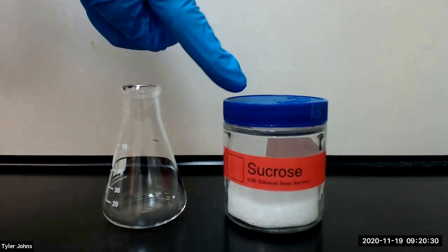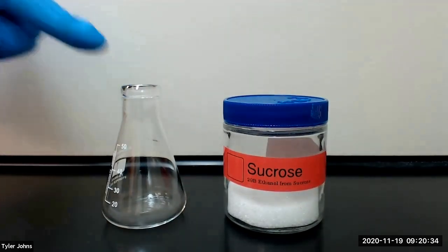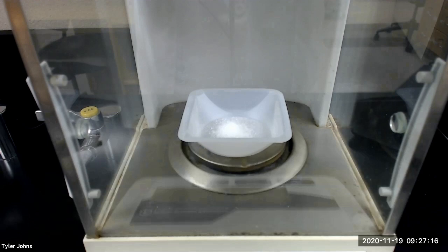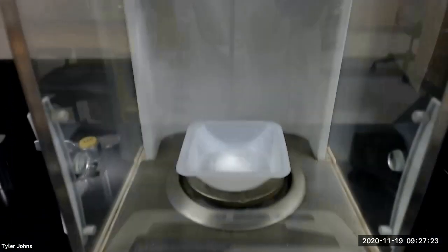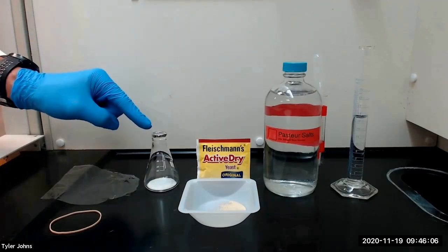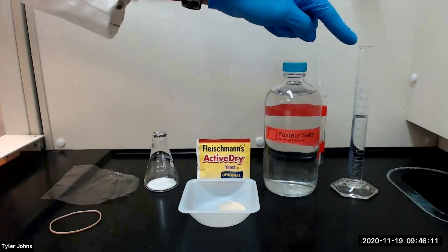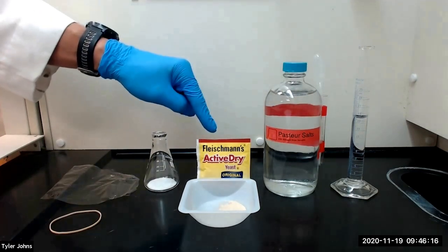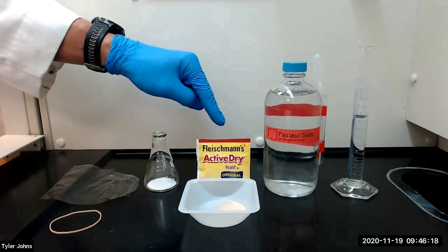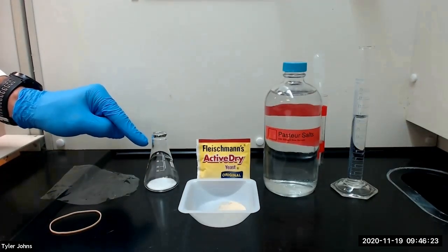To begin, we will add approximately 2 grams of sucrose to a 50 milliliter Erlenmeyer flask. The mass of sucrose that we will be using is 2.0076 grams. After adding our sucrose, we will next add 18 milliliters of warm tap water, 2 milliliters of pasture salts, and 0.2 grams of dried yeast to the flask and swirl to mix.